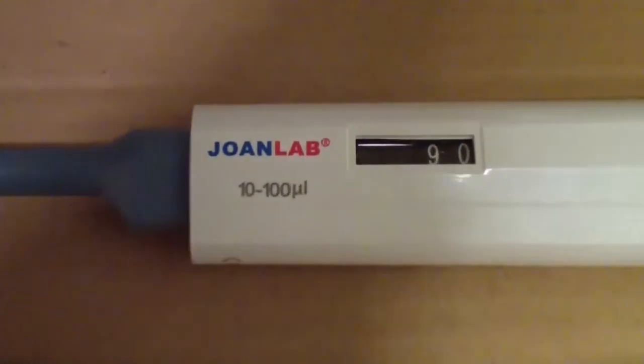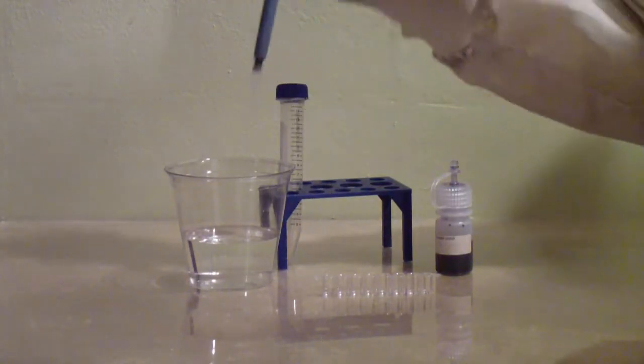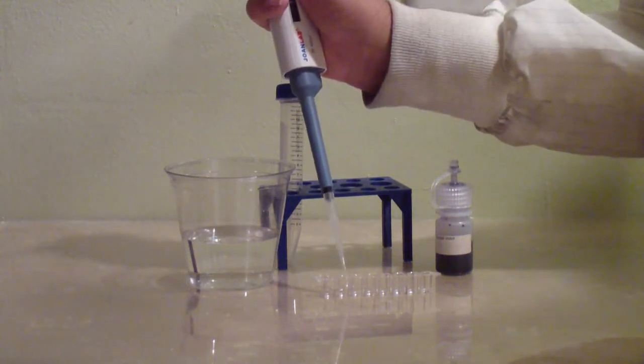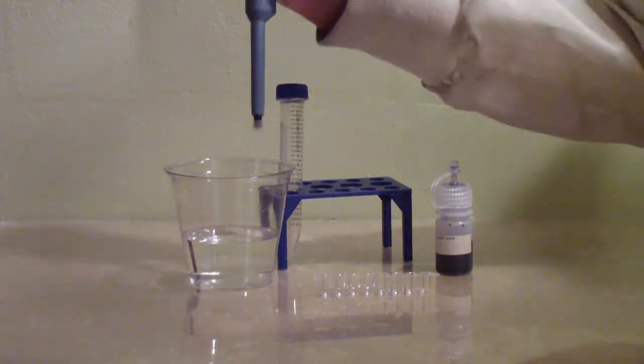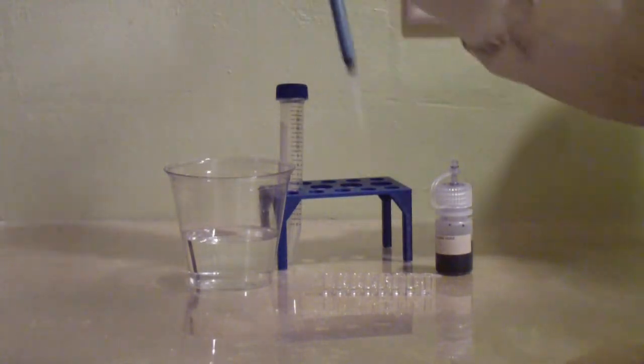Set the pipette to 90 microliters. Pipette 90 microliters of water into each of the eight wells of the ELISA strip. Hold the ELISA strip up to ensure that all the wells have an equal amount of liquid in them.